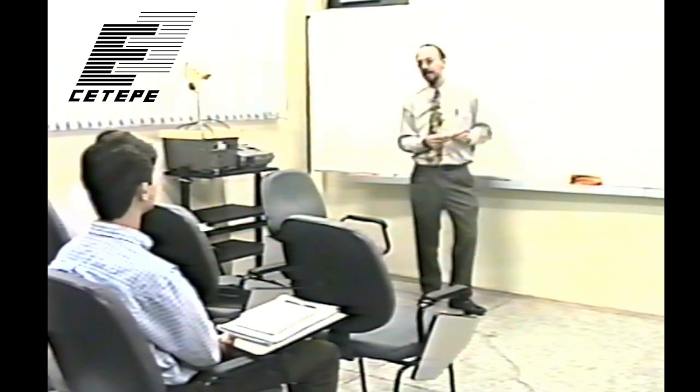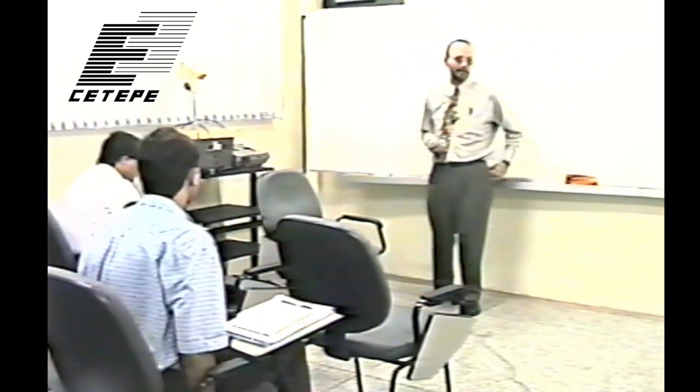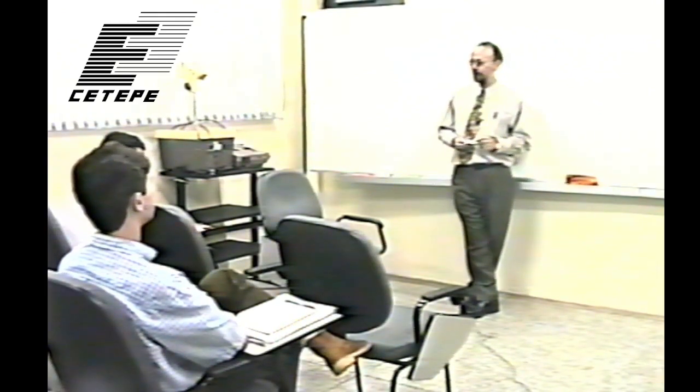Did you say anything about the synchrotron in your introduction? No. As you all may or may not be aware, there is a synchrotron in Brazil, in Campinas. No, I said this. Oh, you said it? Okay. One of the reasons that I continue to stay in contact with Marcos, besides the fact that I like him so much, is this connection with the Brazilian synchrotron. It's our hope to exploit the monochromatic energies and the very, very intense radiation at the synchrotron to do some high resolution micro imaging.